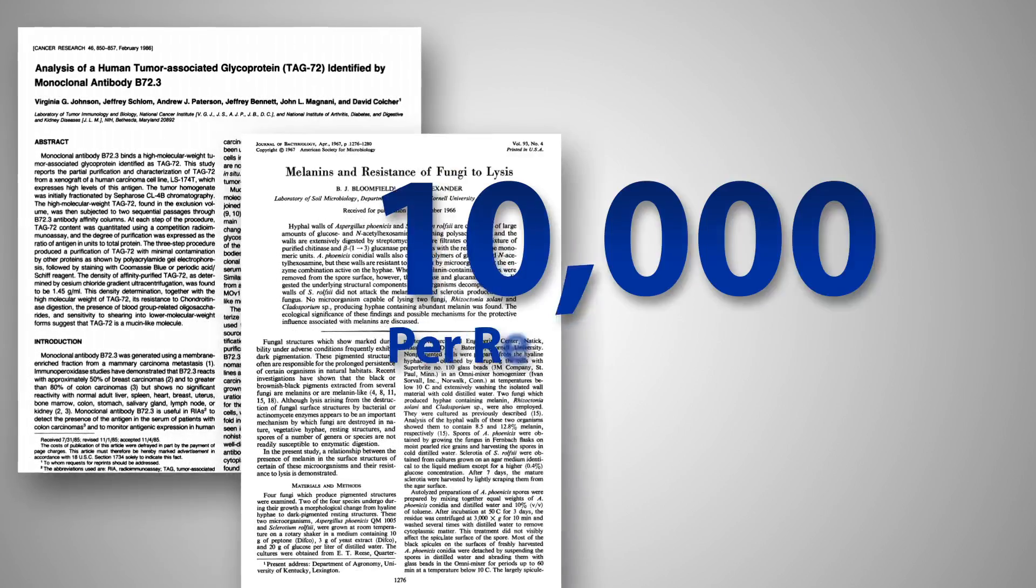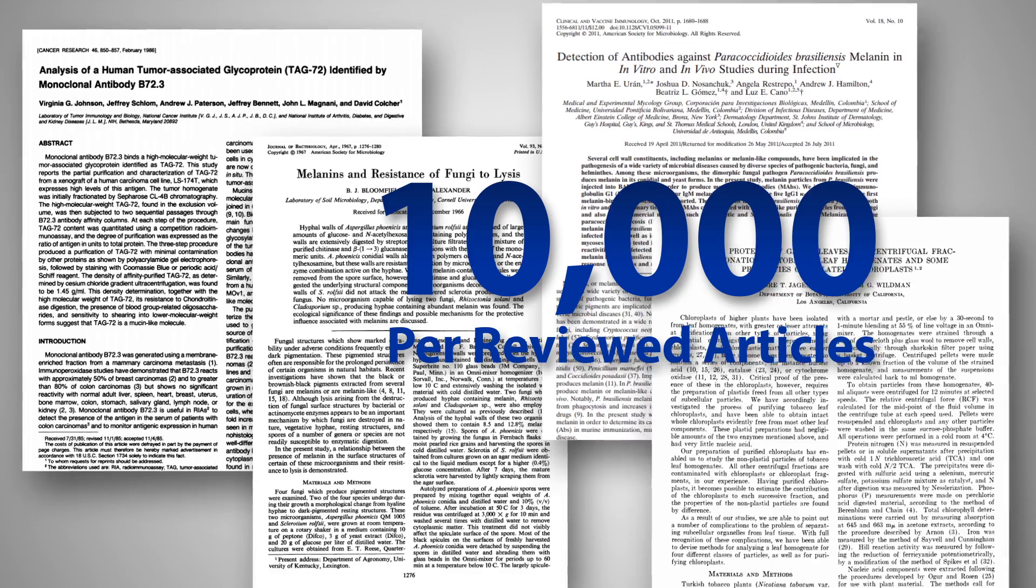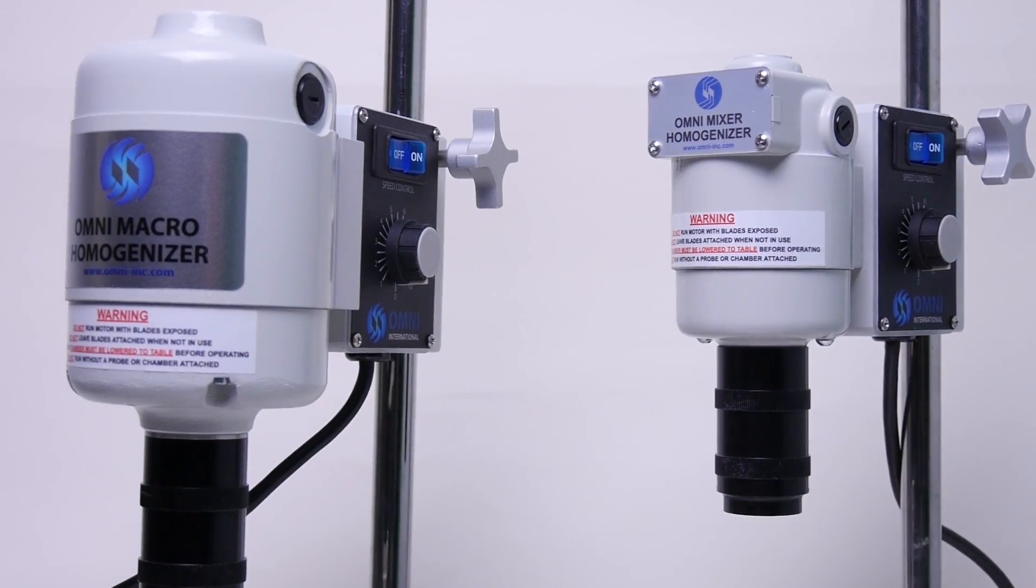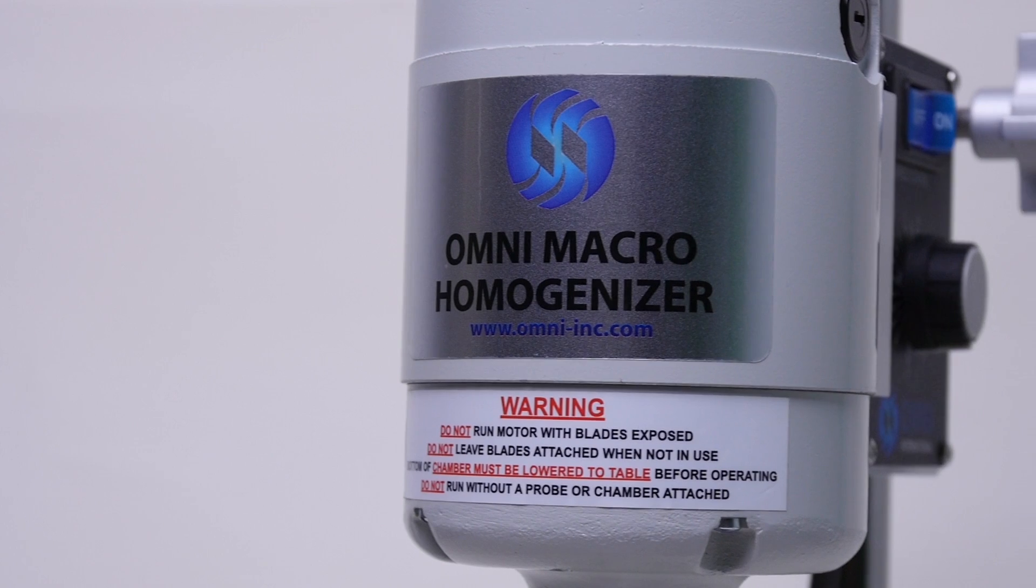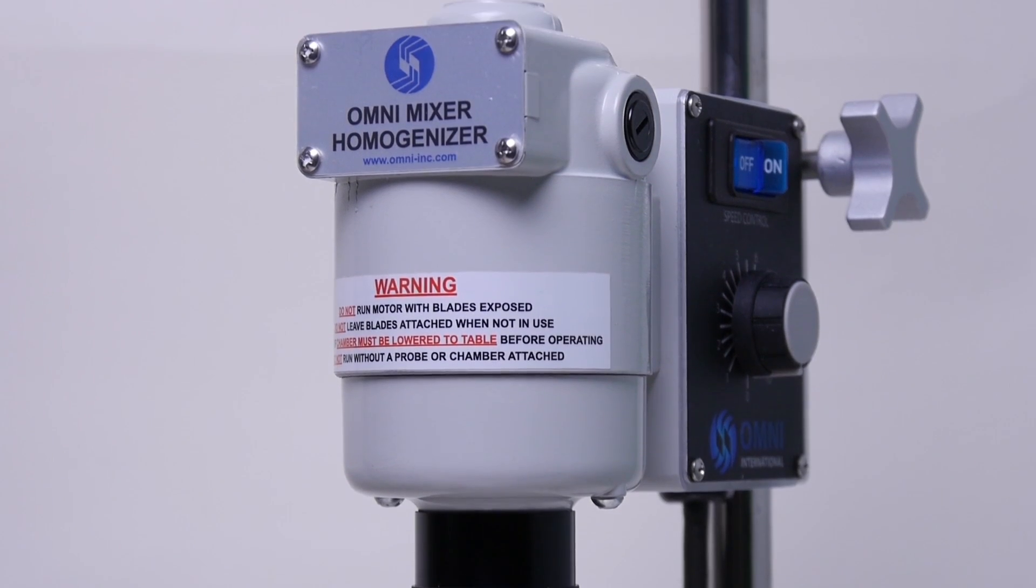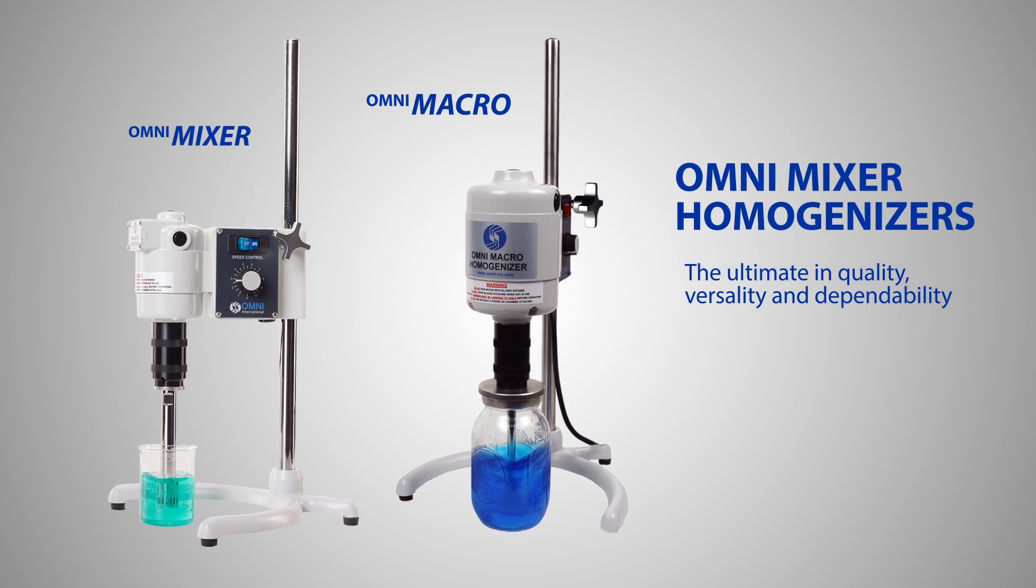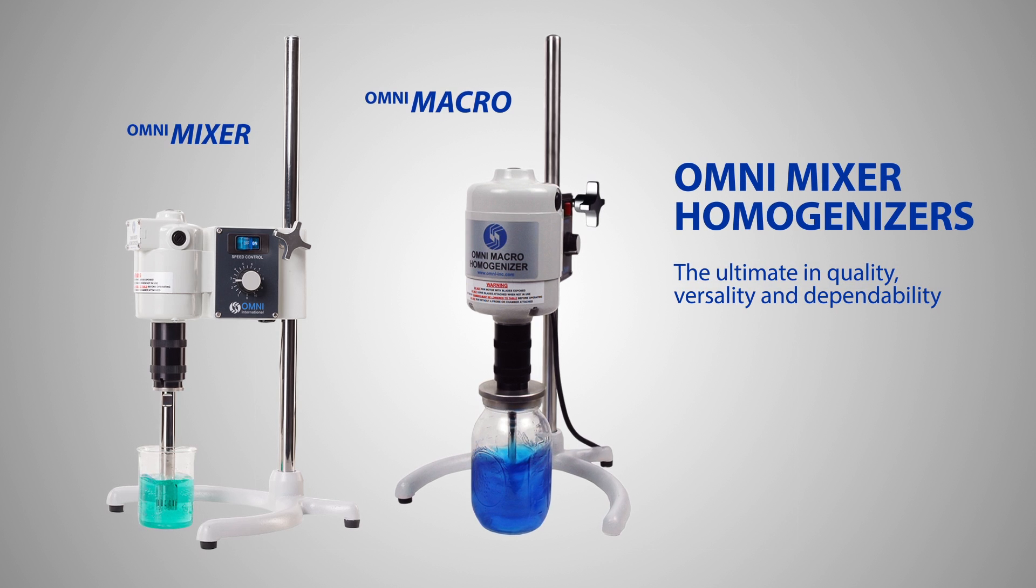Referenced in over 10,000 peer-reviewed articles and used in thousands of laboratories worldwide, Omni Mixers are renowned for their durability and can be relied upon for years of trouble-free operation. Omni Mixer homogenizers, the ultimate in quality, versatility, and dependability.